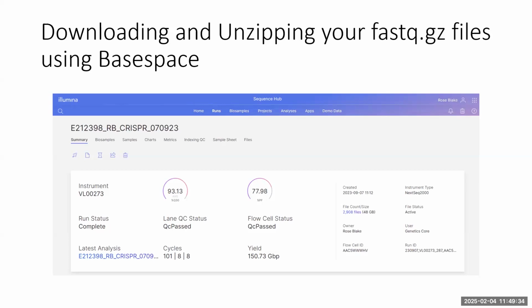And so they'll do it, and you have to use very high electrocompetent bacteria, very nicely purified DNA, get the ligation to work really well, and then plate them out on huge plates where you get loads and loads of colonies. If you do all those steps well, then you get a really nice, what's called a skew score. So what you want is the lowest potential skew score, which means it's closer to a straight line. I think the maximum skew score you would want is 10. Anything above that, you're starting to look at that library and not be particularly happy about it.